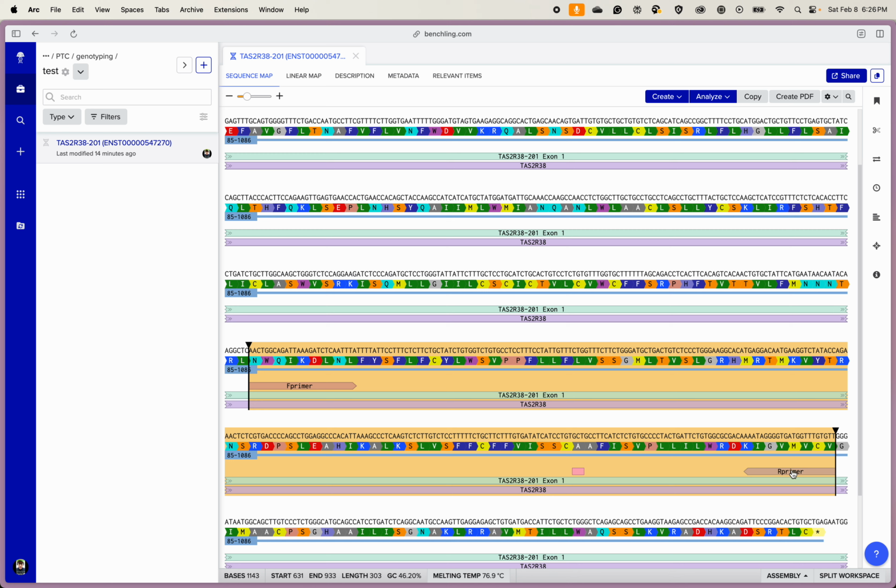file. Okay, so the sequences came back, spoiler alert, and we are in business. So we are definitely cooking. I'm going to be posting links to the data, so stay tuned for that. But what you're going to do is we can import this stuff.